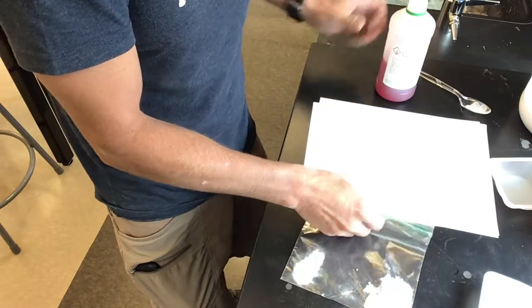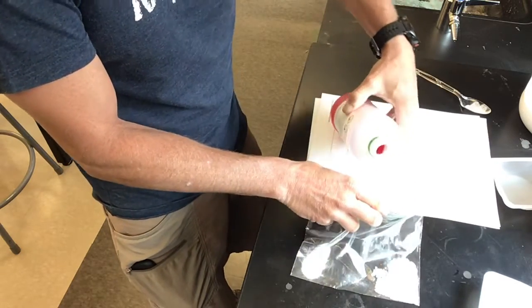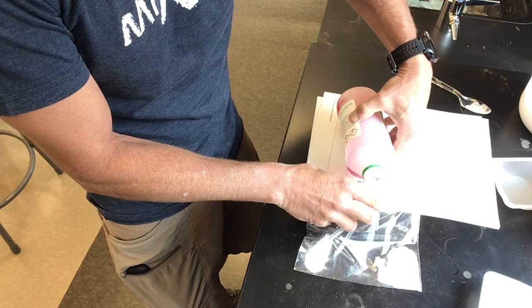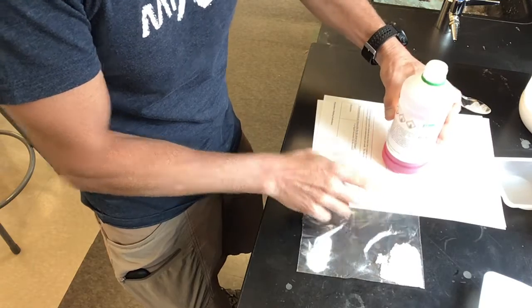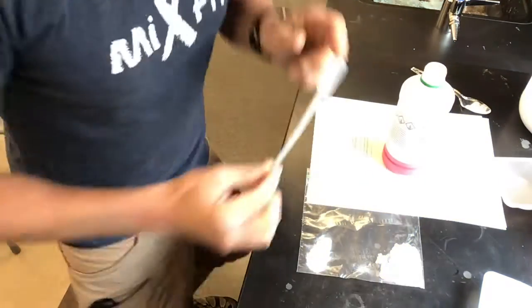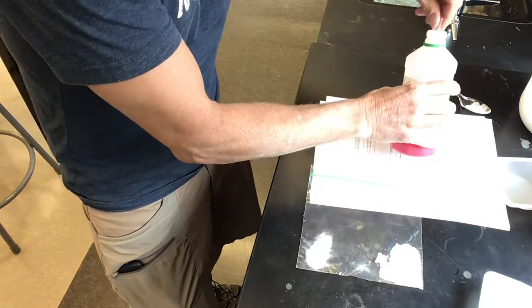It says here a few generous squirts. Actually, you know what, I should do this right. I'll be right back. All right, so there's your pipette, and you will add a few generous squirts.